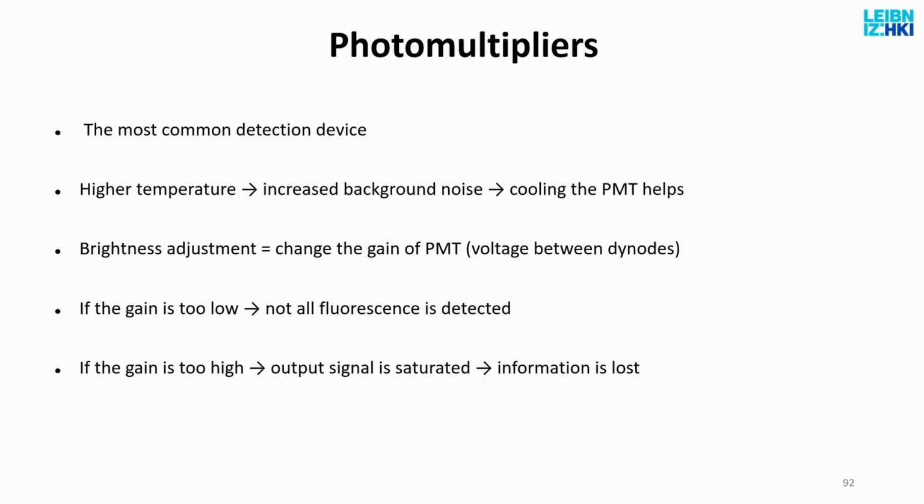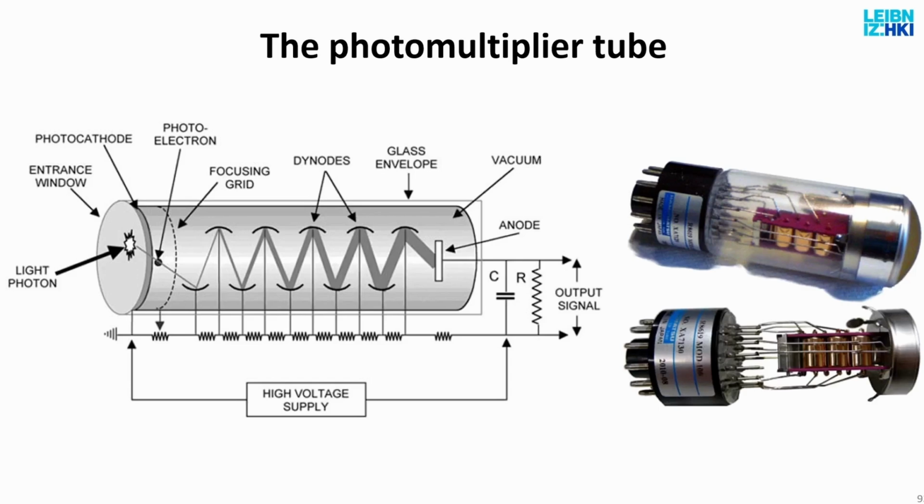But because of that, I can switch from a camera to a so-called photomultiplier, which is a much more sensitive device. And it looks like that. So the principle is that you let a photon enter this vacuum tube where it hits a metal shaped accordingly.